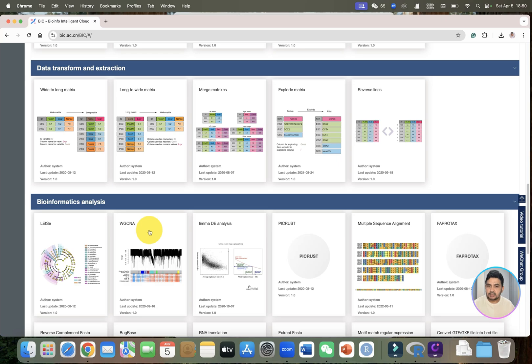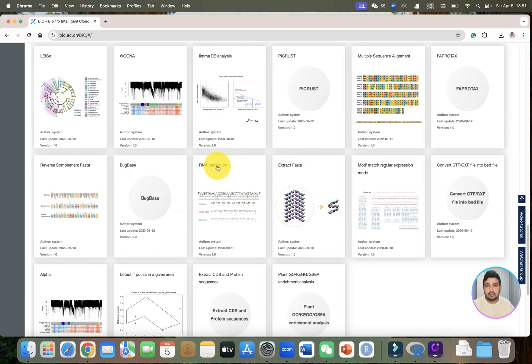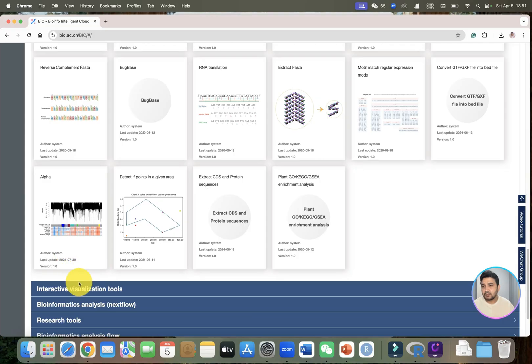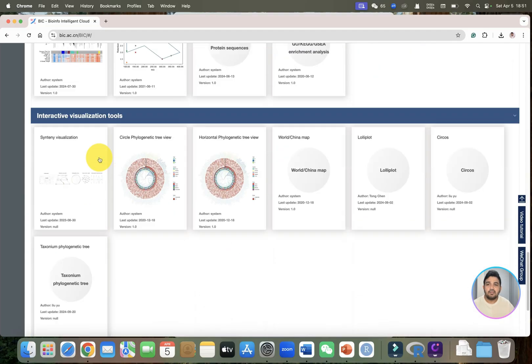I believe this tool is going to be super helpful for all the students who are into biology or bioinformatics. In addition to that, you can see limma DE analysis, PCrust, multiple sequence alignment, RNA translation, extraction of FASTA sequences, and many more.